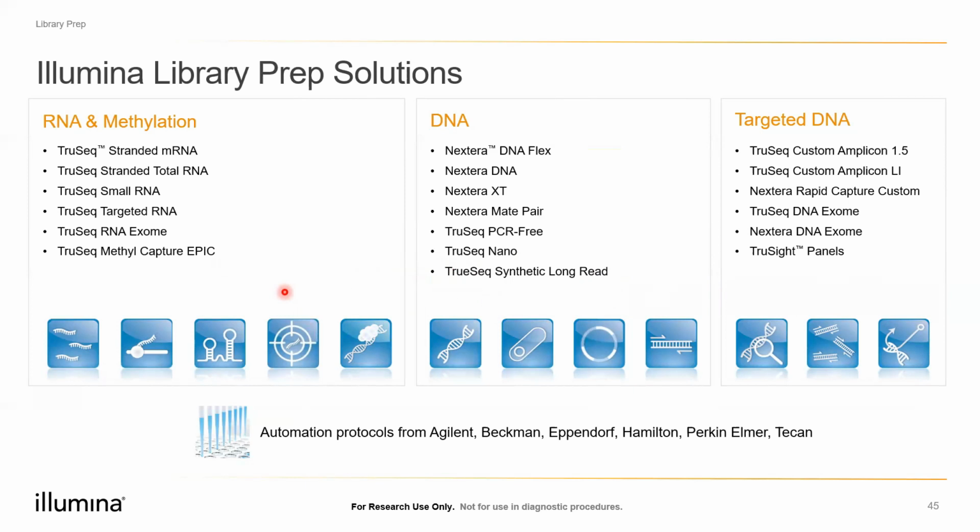That can be prepared with that library prep kit, and then you can go ahead and sequence on the sequencer of your choice, whatever data you want. There are certain kits that are very broad range, and there are certain kits that are very specific, like your clinical library kits, let's say CPGS. So they are very specific for certain applications.